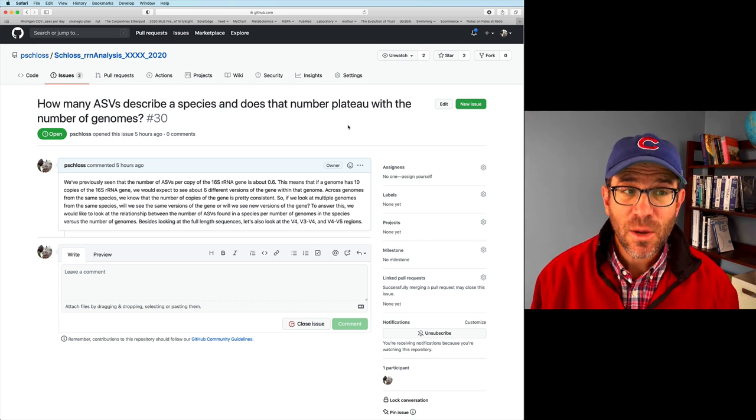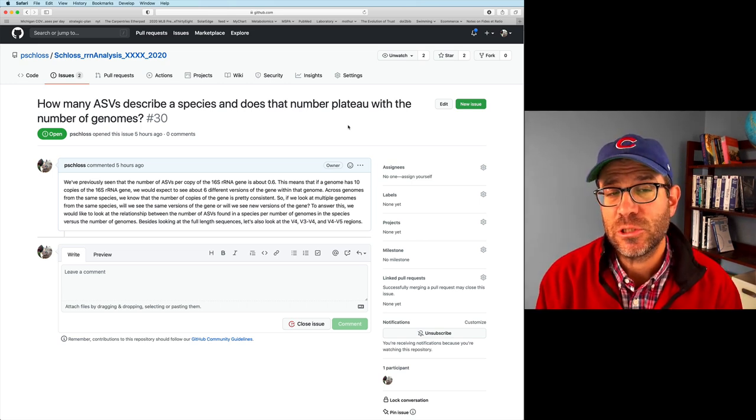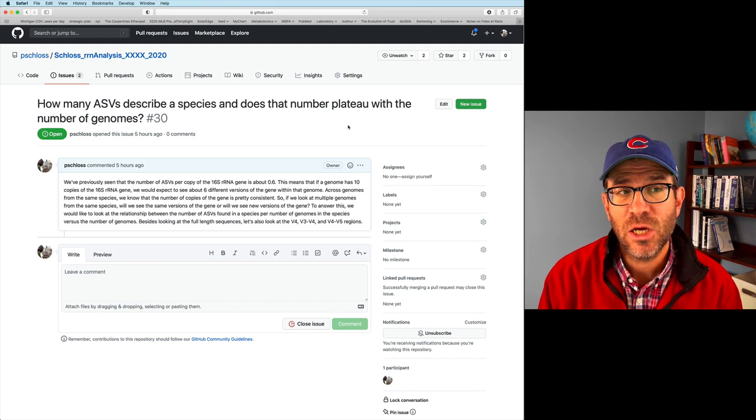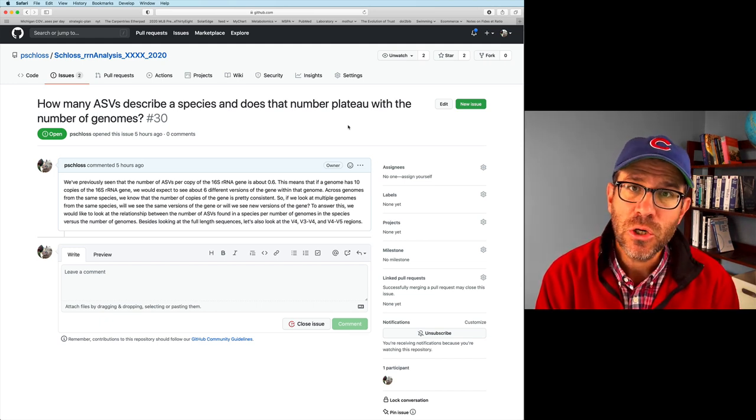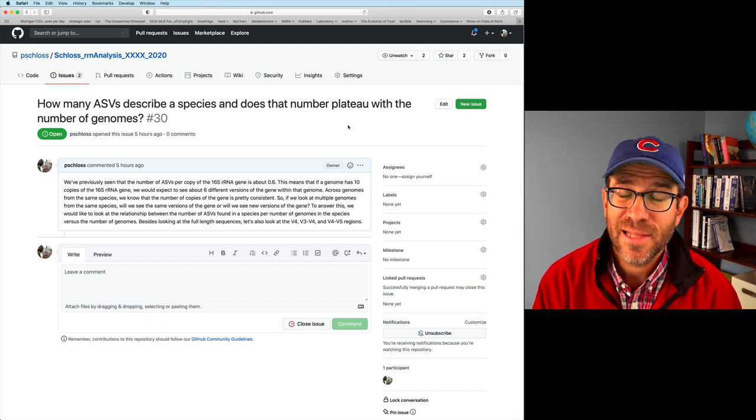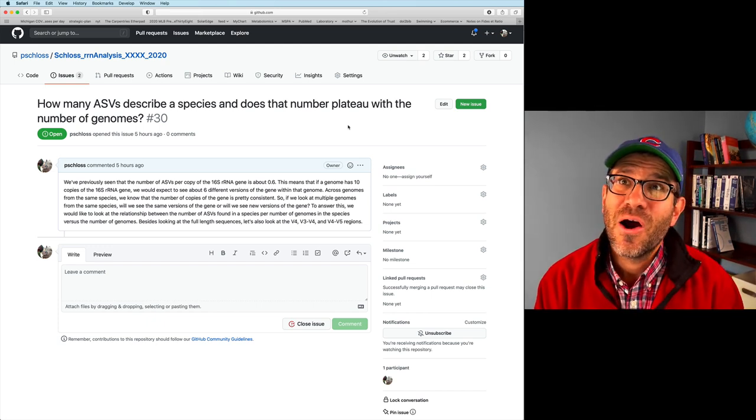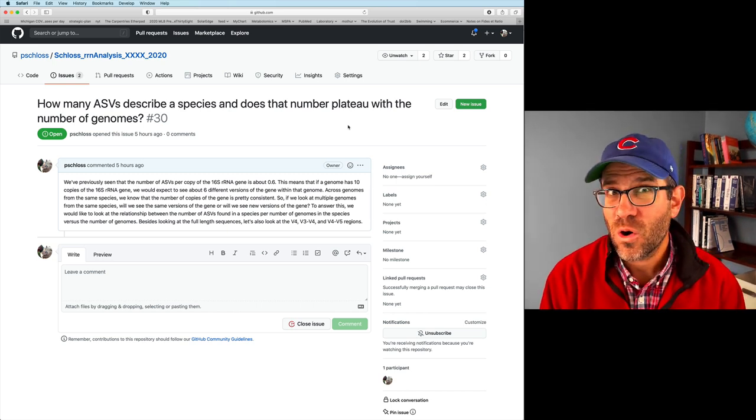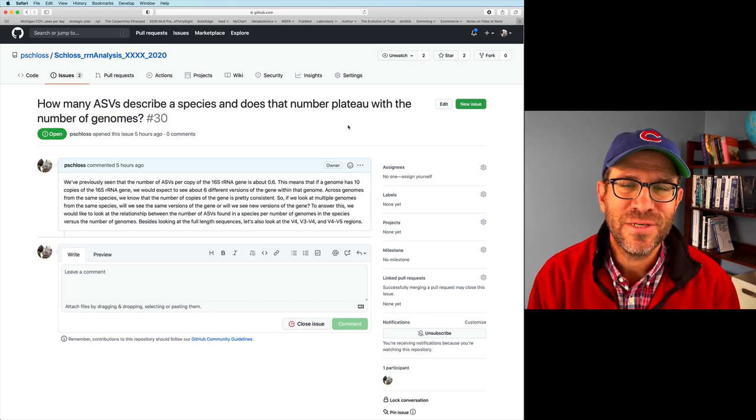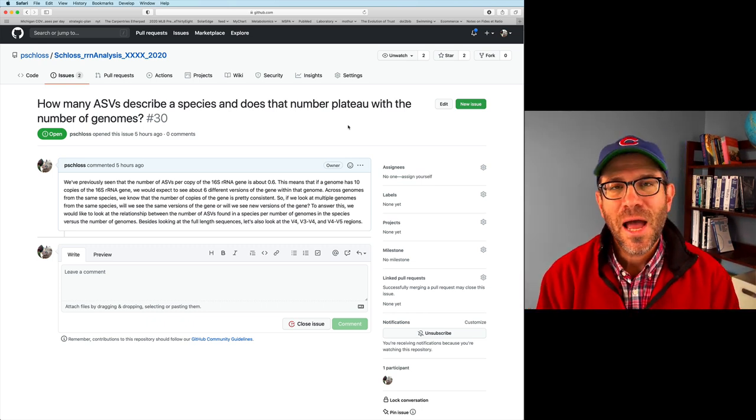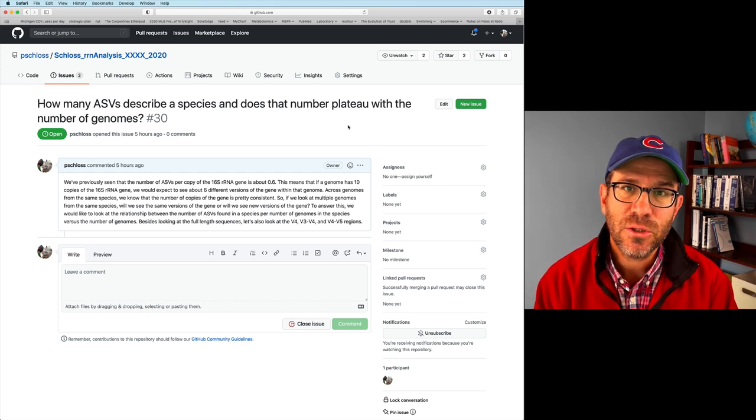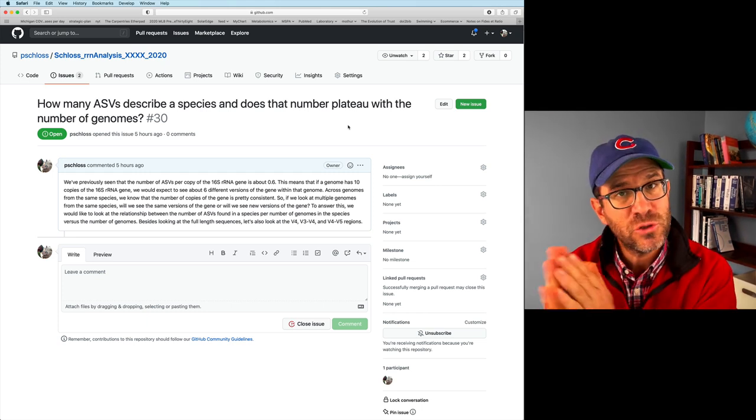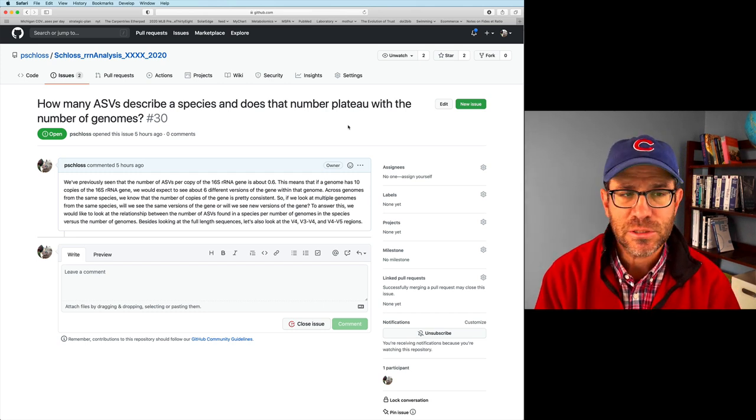As I mentioned, today I want to investigate how many ASVs describe a species and whether that number will plateau with the number of genomes. So E. coli has over 900 different genomes represented in the database. And so one question we might ask is, are there 10 ASVs for E. coli? Or are there maybe 2,000 ASVs for E. coli? And, of course, E. coli is just one bug that we all know. But how does it vary across other genomes? And is there a relationship between the number of genomes we've sampled and the total number of ASVs for each species?